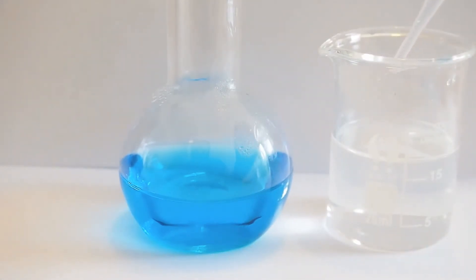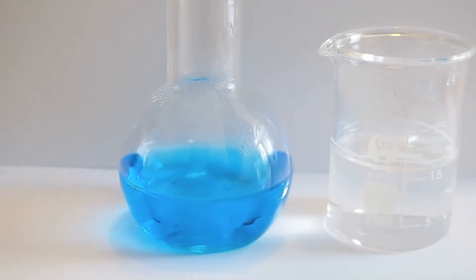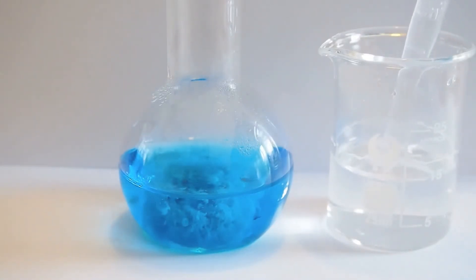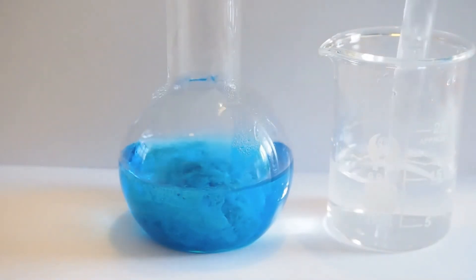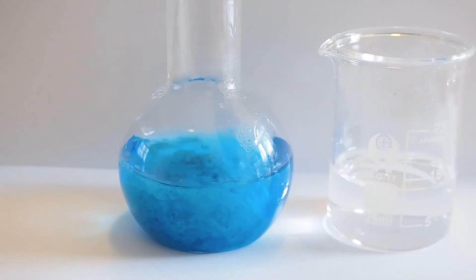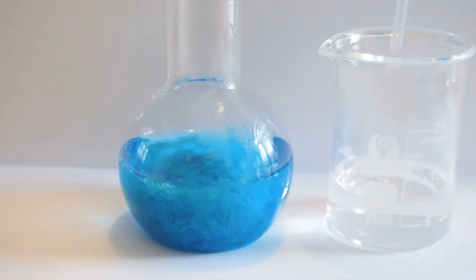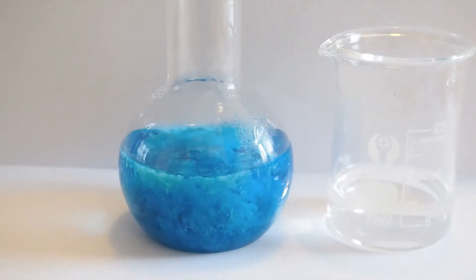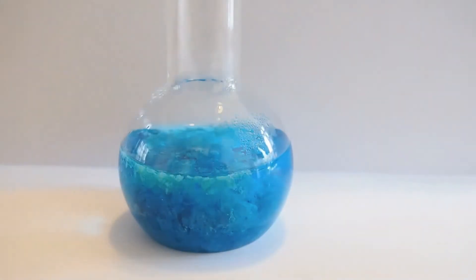What I'm going to do is add the sodium carbonate to the copper sulphate solution. Watch closely, see if you can see what's going to happen. Can you see that precipitate forming as it drips in? That's the basic copper carbonate forming. Let me add a bit more, and I'll swirl this a little bit to mix it.